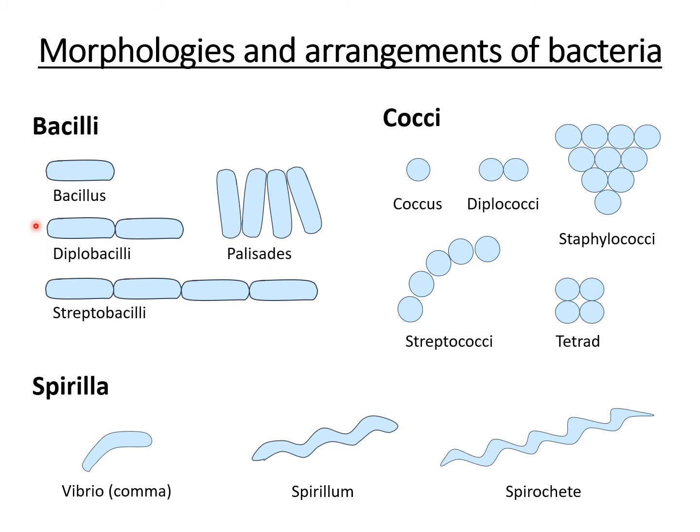Okay, so if a bacteria out there is a diplobacilli, so it looks like a rod and they are paired, it's always going to look like a diplobacilli. Anytime you view that specific bacteria, it's always going to look the same under the microscope. It's not going to look like a diplobacilli today, but then a week later look like palisades. Absolutely not. Okay, guys? What is palisades?